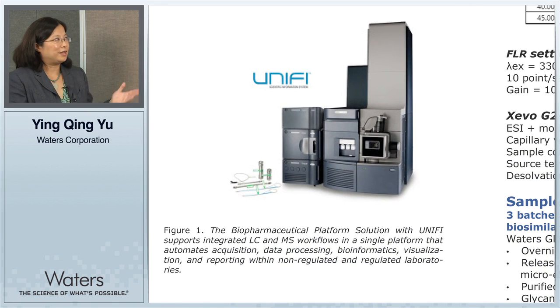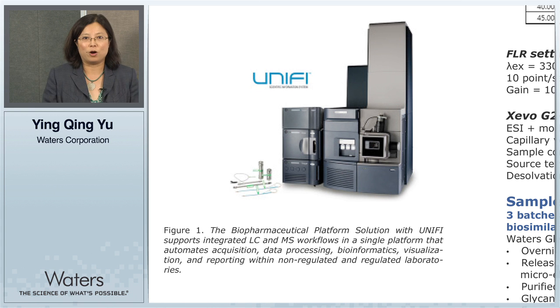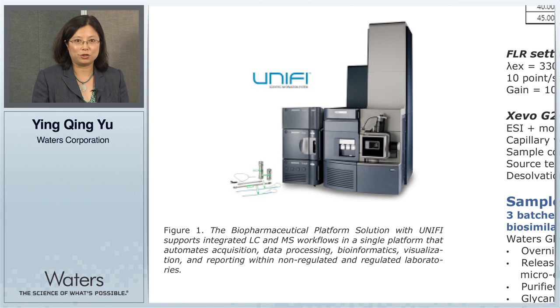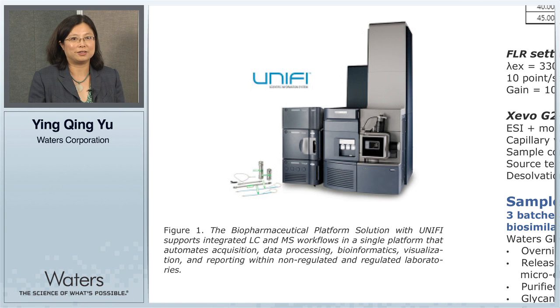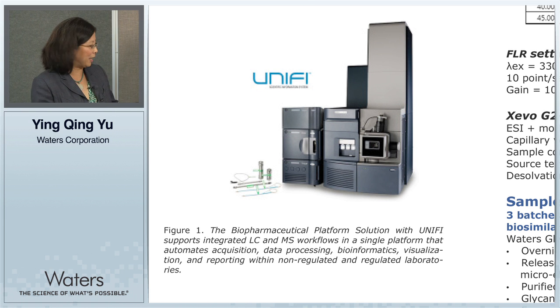For this study, we are using this analytical platform from Waters called the Biopharmaceutical Platform with UNIFI version 1.7, comprised of an H-Class Bio system with fluorescence and the Xevo G2 QTof MS detectors. Here's a picture of what the system looks like.